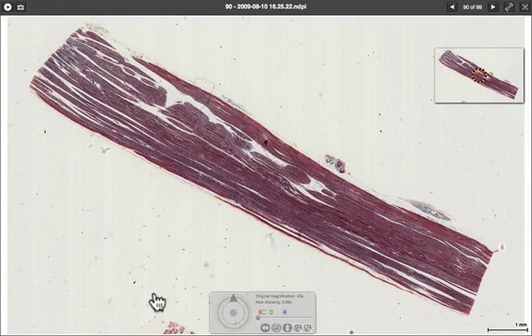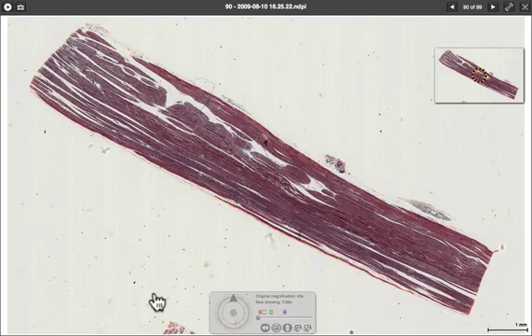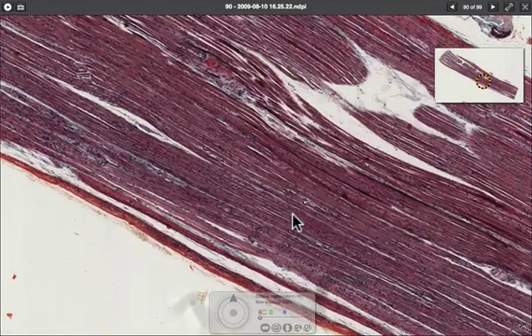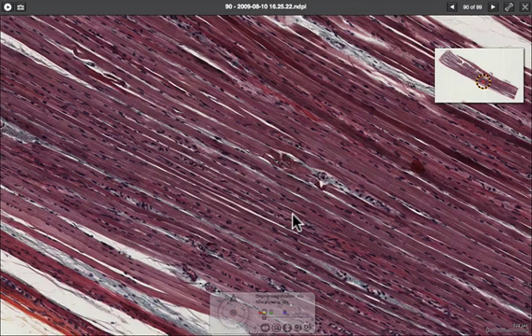We're going to talk about muscle. There are three types of muscle found in the body: skeletal muscle, cardiac muscle, and smooth muscle. Each of them has in common that they perform contractile functions, but there are big differences between one type and another.